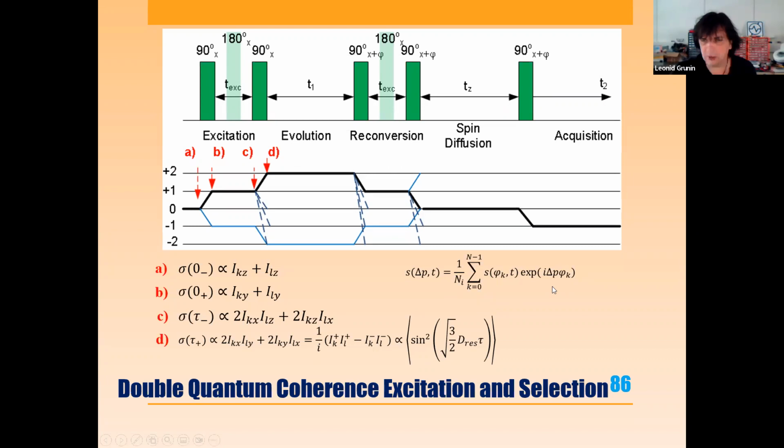So this exponent is something that we are doing during acquisition of a complex signal. In modern NMR, all detection is happening in the so-called quadrature way, where you have real and imaginary parts. It means that you are multiplying your signal with the exponent with the complex frequency. And this complex frequency, in this case, will contain the additional multiplier that will correspond to the Fourier transform of the coherence order that you need to get.